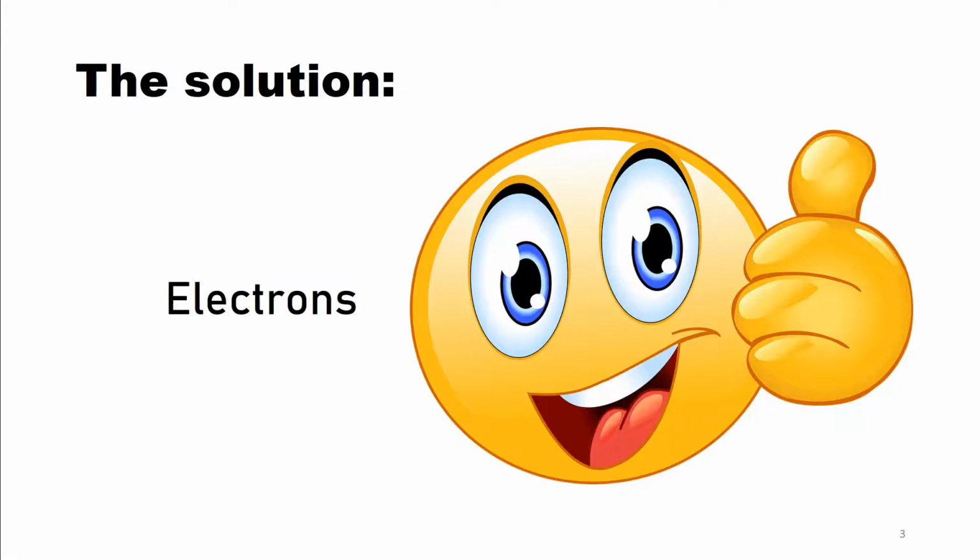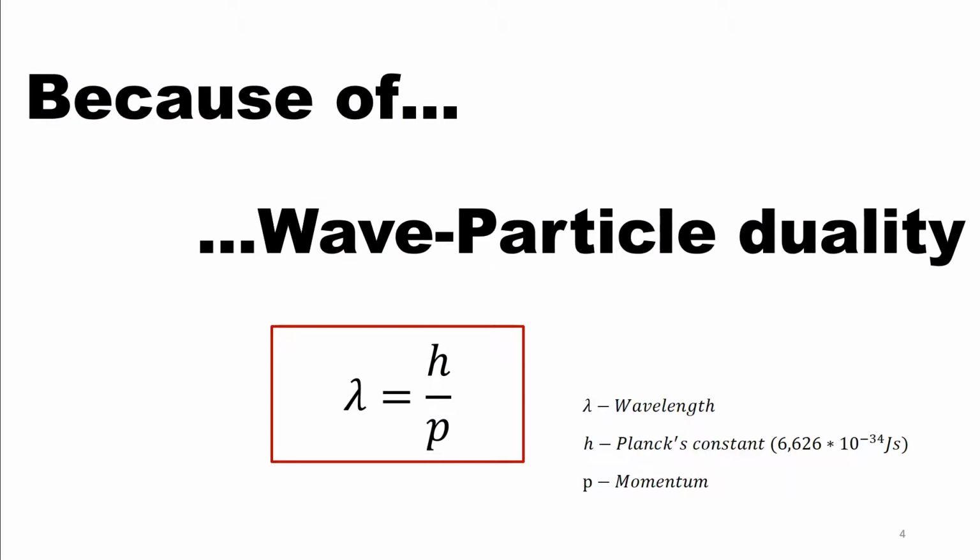Well, you are only partly right, because electrons are kind of both. If they need to be a particle, then they behave like a particle. But if we need them as a wave, then they can behave as that as well. And you can actually calculate the wavelength of electrons with the de Broglie equation. Do me a favor and calculate the wavelength of an electron for 200 kiloelectron volts, which is typical for a TEM. Do you think we are still limited to diffraction?